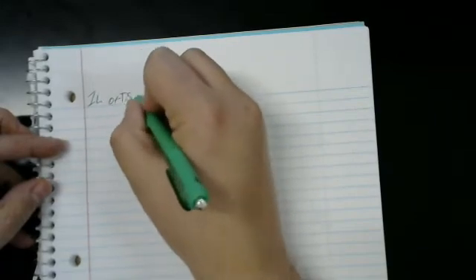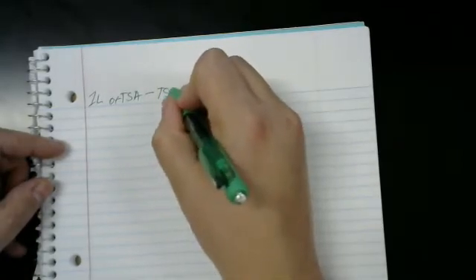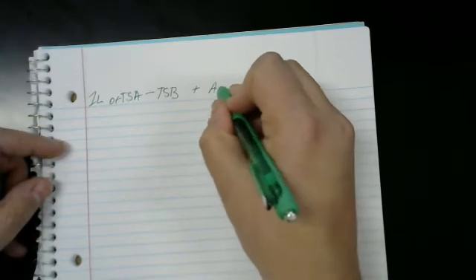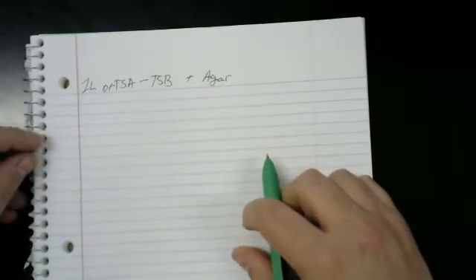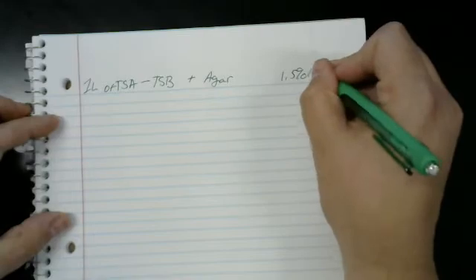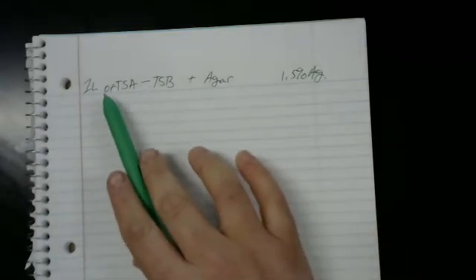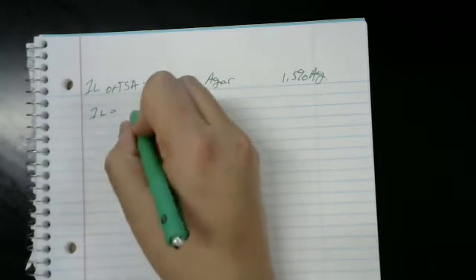So if I ask you to make, let's say our goal here is to make one liter of tryptic soy agar. That means we're going to need two components. We're going to need tryptic soy broth and agar. Where do we get these types of things? Well, we're going to go to our agar powder, which I have right here. In this case, we're just going to use 1.5% agar. One liter is 1,000 mils.